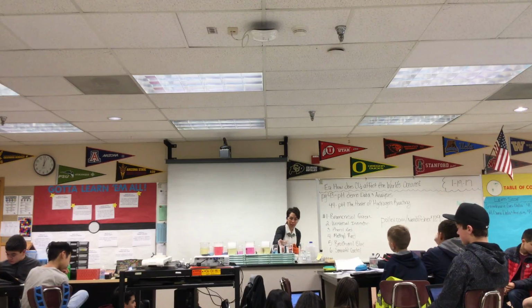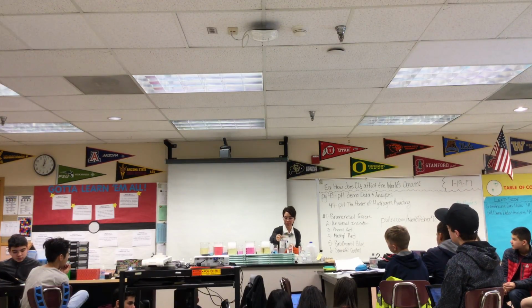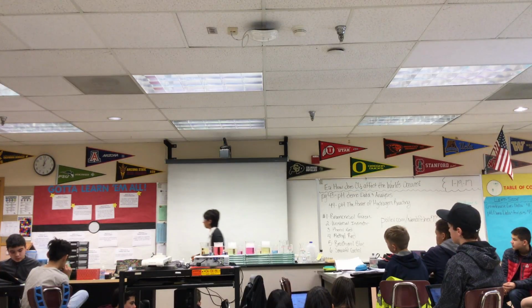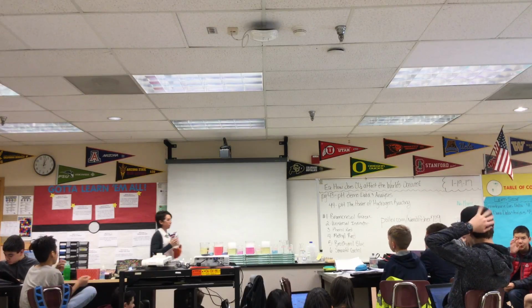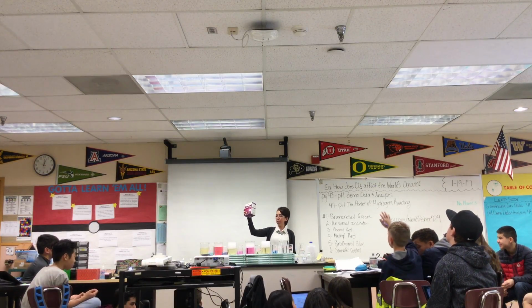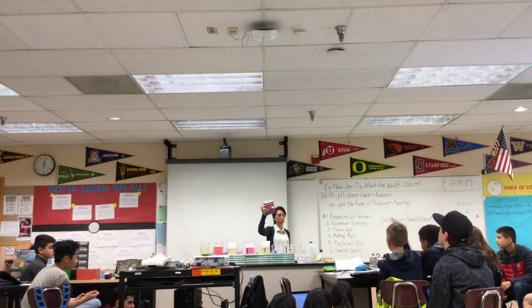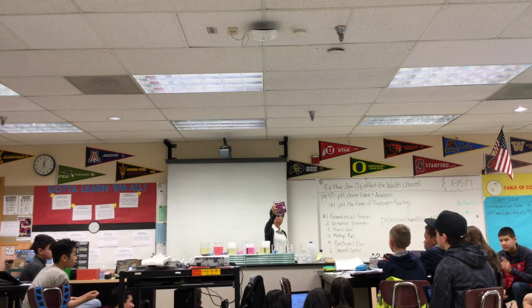So right here, I have some simulated seawater. I went to Petco and I bought this stuff. I'll show you, because you're going to be using this for a lab you're doing next week. It's called Instant Ocean. This is what you would use in saltwater aquariums. To keep it in control, we'll all use the same stuff.